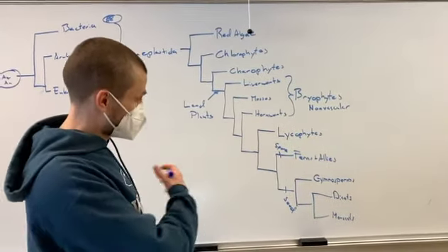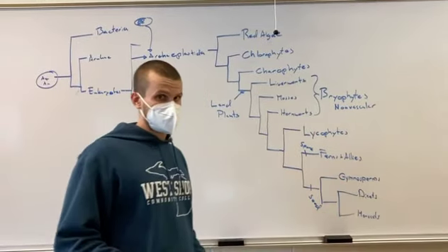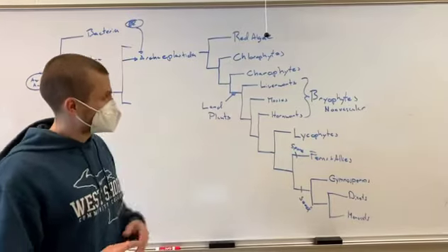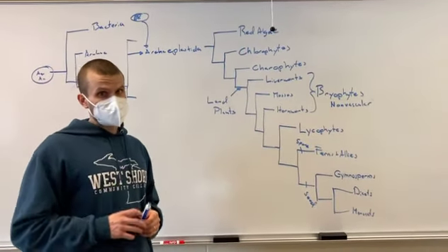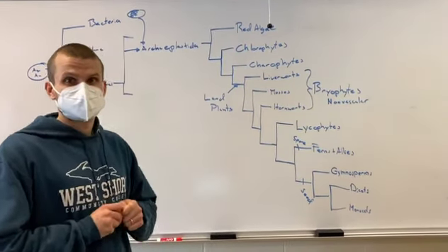I've left some of the traits on there, like the fact that seeds unify these different species. Your task, in order to get the lab started, is to fill in the rest of it with different traits. Once you're done with that, I'll see you over by our terrarium tanks to take a look at some of our bryophyte diversity.